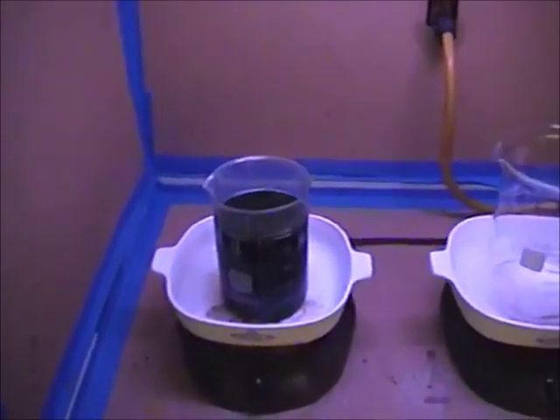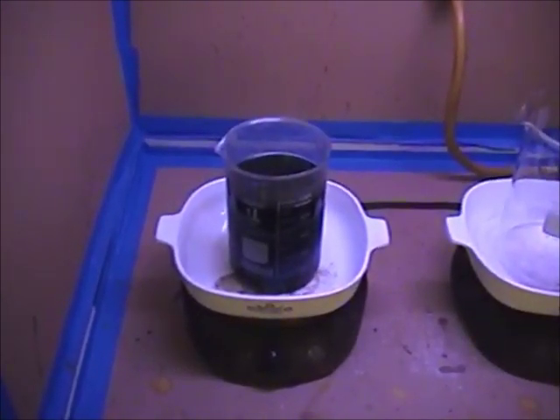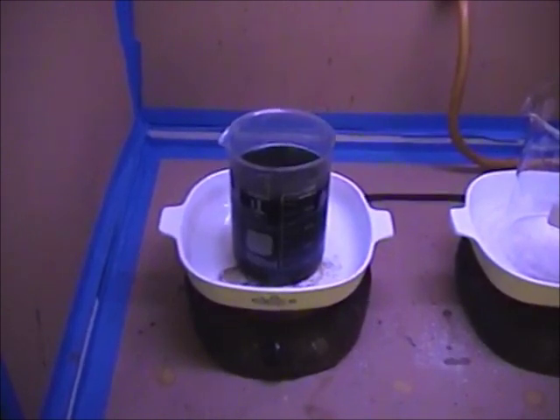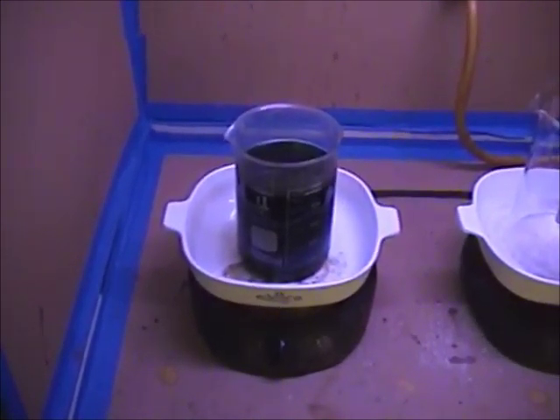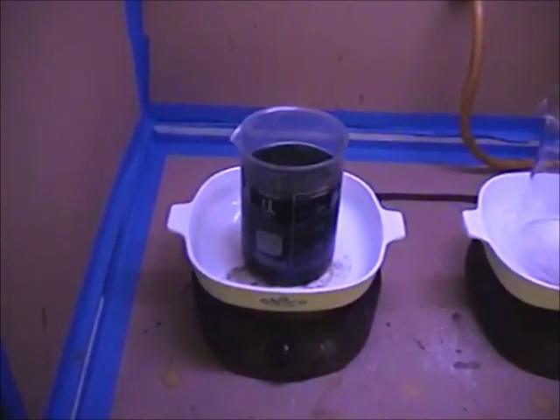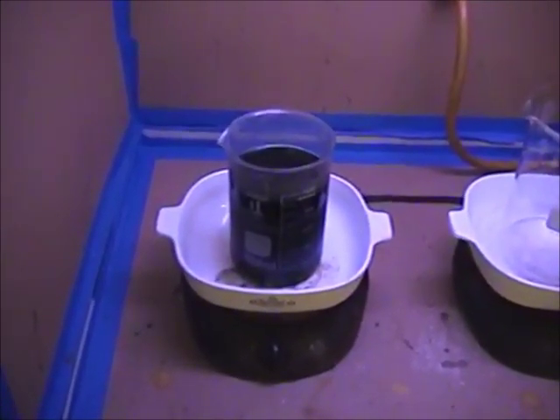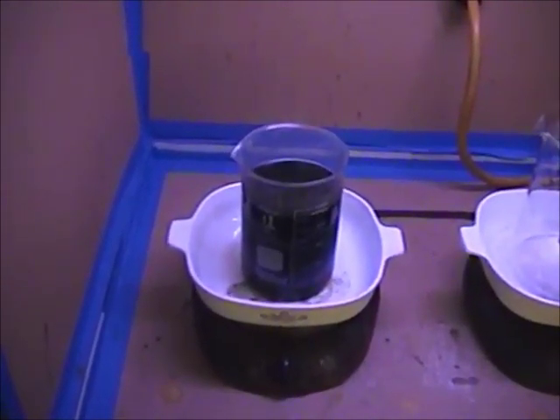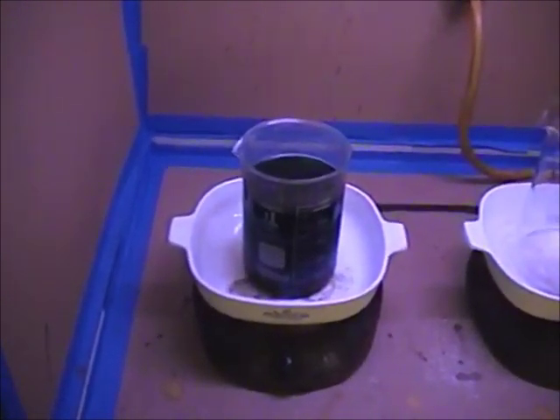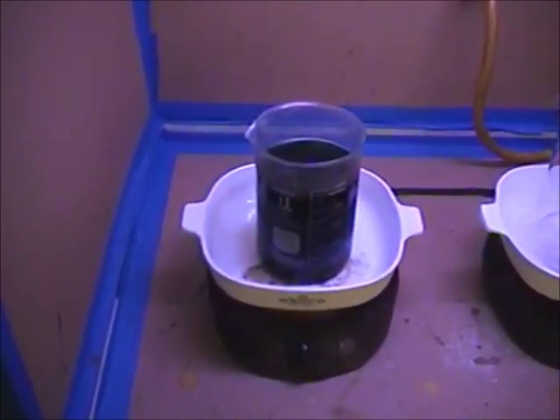And over here in our fume hood is the solution that we started with in the first part of the video series. That is some silver and some copper dissolved in nitric acid, recovered from one of my final steps of cementation from the silver cell process. So inside that beaker is probably 80% silver, 20% copper. It's a little trashier than sterling silver as far as the copper content, but I really wanted to see just how well this selective reduction method works for this.